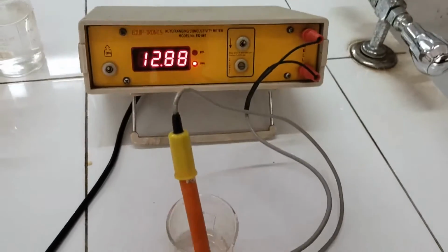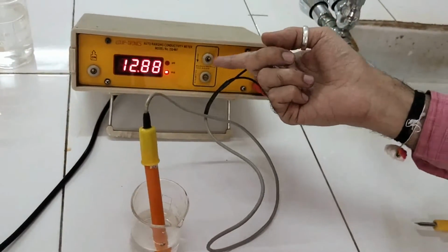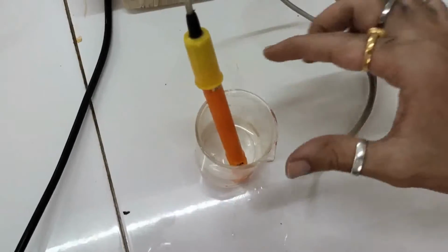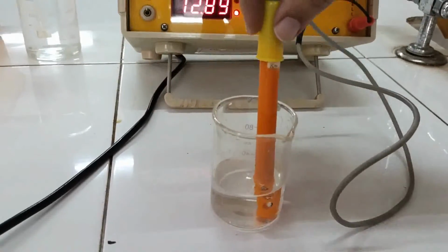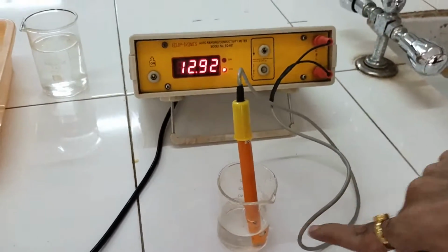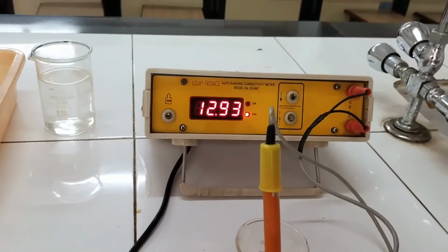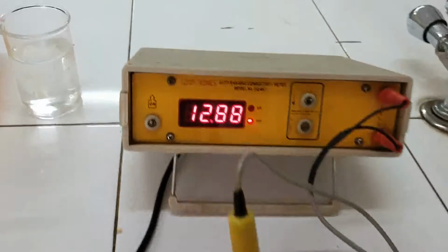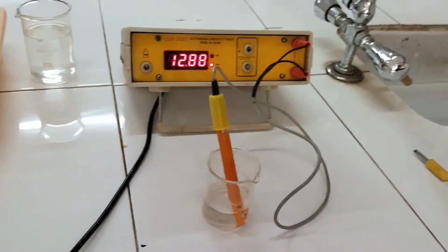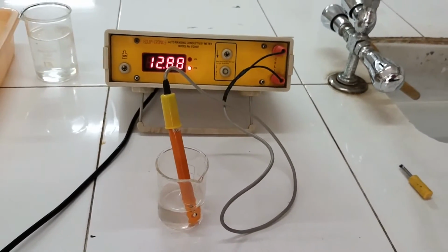Now the next step, my dear friends, is the determination of the cell constant. For this, as I said earlier, the knob has to be on the upper side because the standardization is already done. This is a beaker containing 0.1 normal KCl. We are going to introduce the electrode into this, so that the bottom portion of the parallel plates of the electrode dips into the solution. You can now see the reading, it's 12.88. Of course this has to be multiplied by 10 raised to minus 3. So this is the conductance of the 0.1 normal KCl solution.